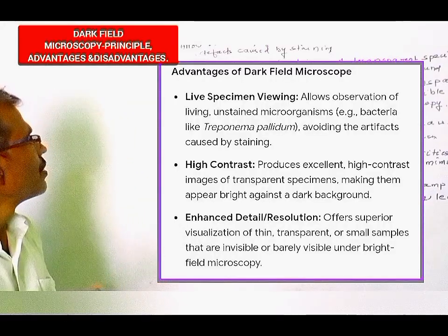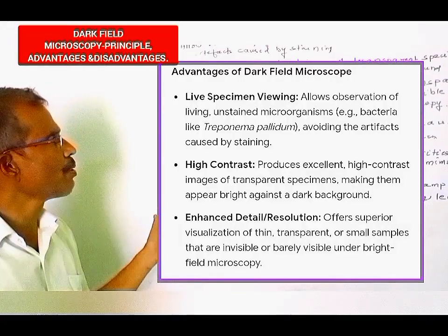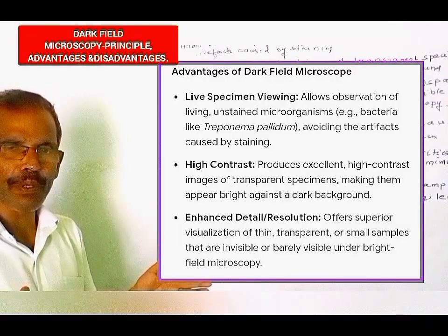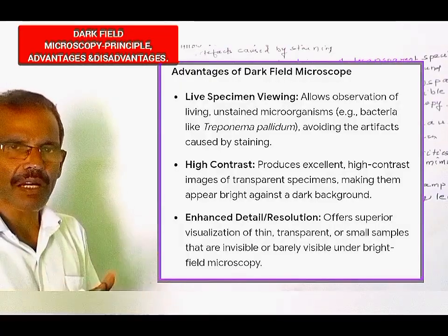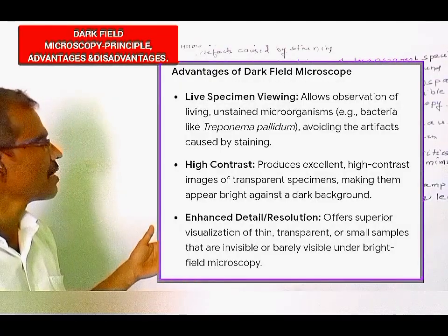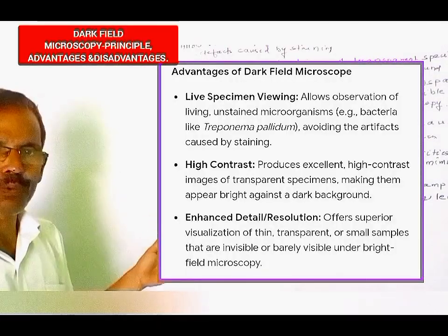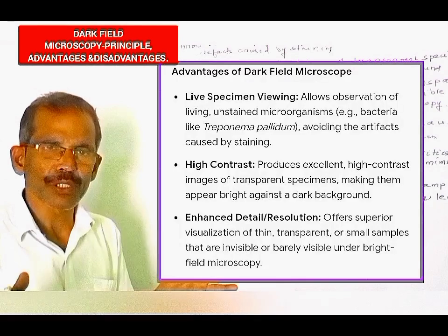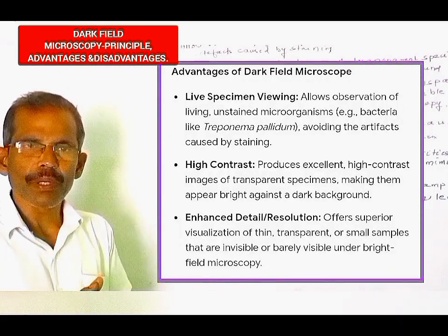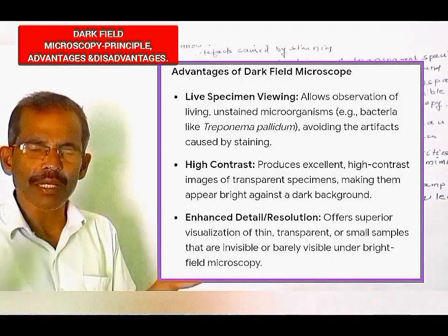Number 2, this technique produces a high contrast image of transparent specimens, making them appear bright against a dark background. In addition, this technique offers superior visualization of thin transparent specimens or small samples that will be invisible or barely visible under a bright field microscope.